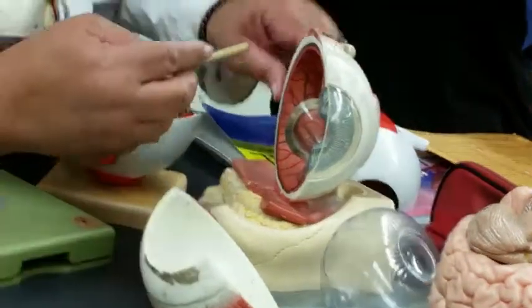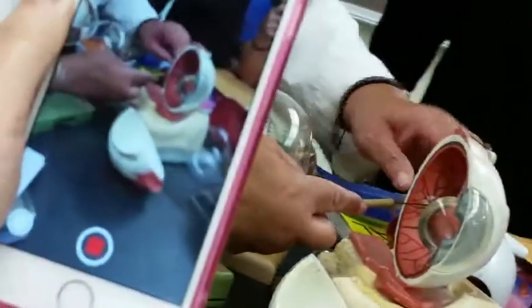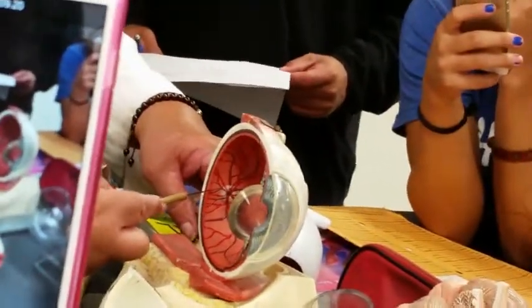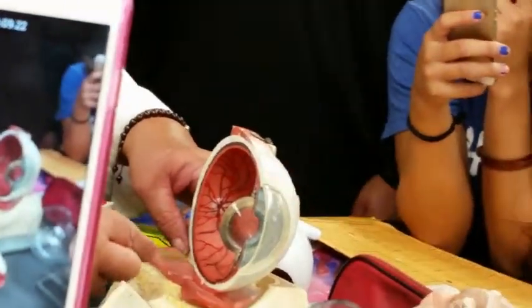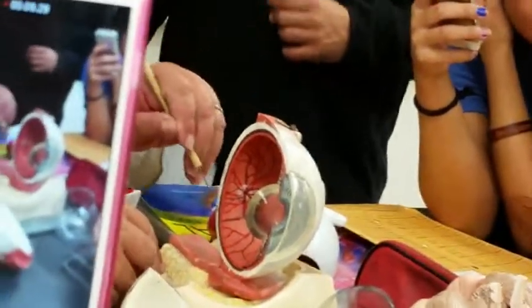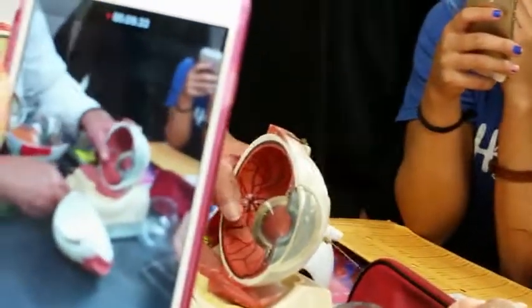And now you're seeing the optic nerve, and this white in front of the optic nerve represents what? The optic disc or the blind spot, and inside here represents the retina. So the sclera, the red represents the choroid, and inside would be the retina.